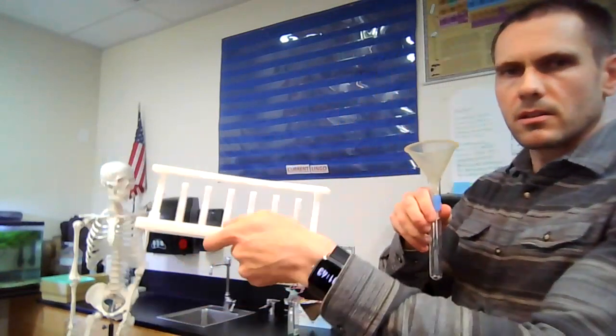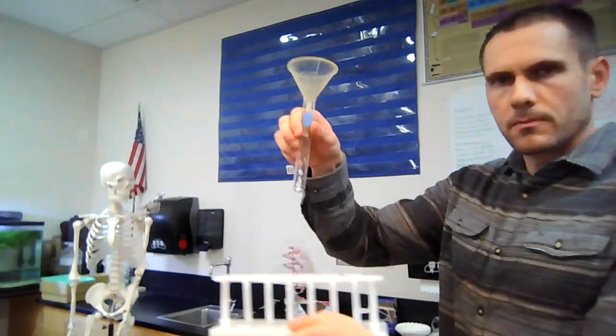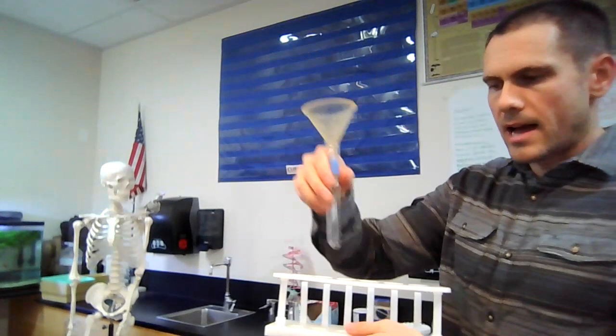All right, once you get all those chunks out, now you're going to build your filtration device. You have a test tube rack. This is just a little device that holds the test tubes so they don't fall over. This is a test tube, this glass. And this is a funnel. So you're going to put the funnel in the test tube like that, because we want to separate out all these solids and liquids. The DNA is going to be in the liquid part, and a lot of the excess cell parts are going to be in the solids. So we're going to separate it out by filtering it.